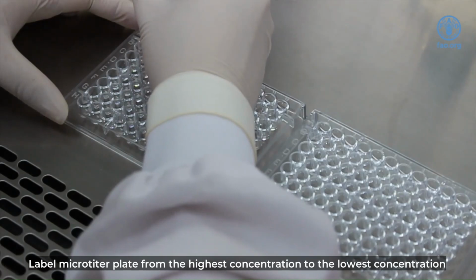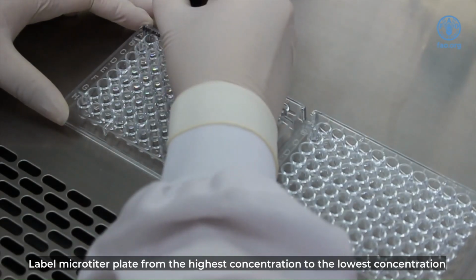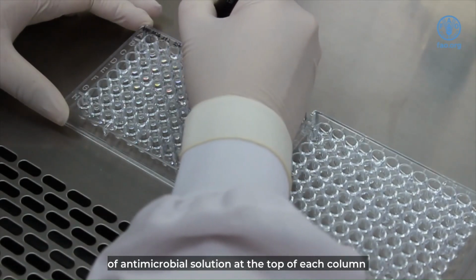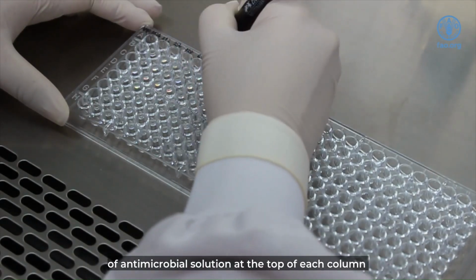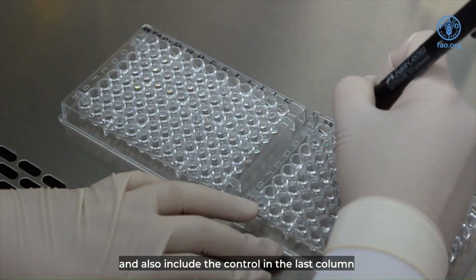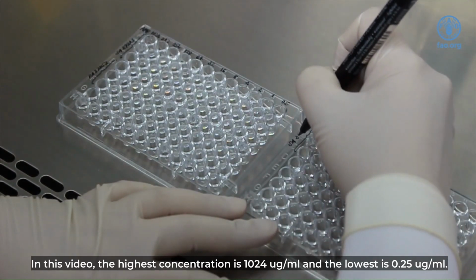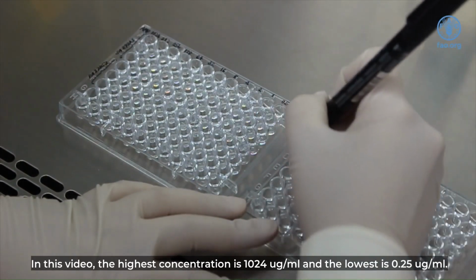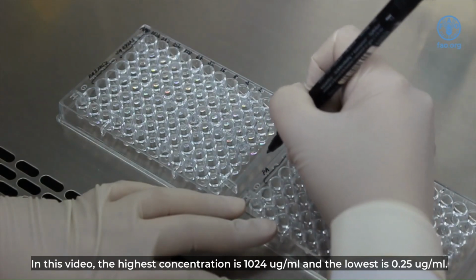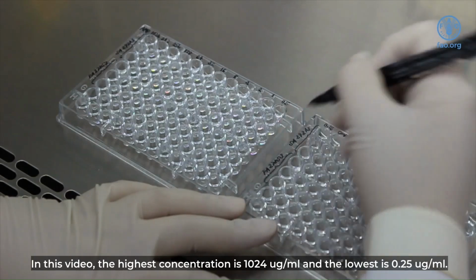Label microtiter plate from the highest concentration to the lowest concentration of antimicrobial solution at the top of each column, and also include the control in the last column. In this video, the highest concentration is 1024 micrograms per milliliter and the lowest is 0.25 micrograms per milliliter.